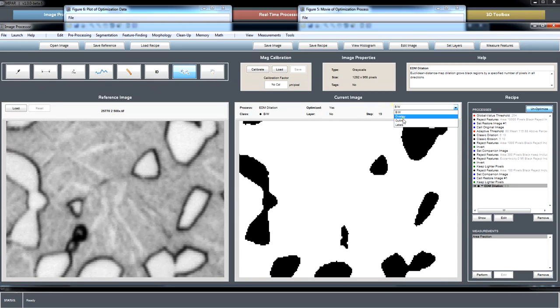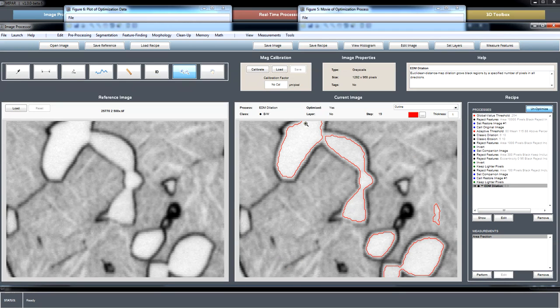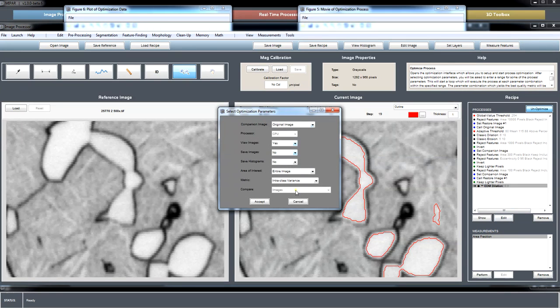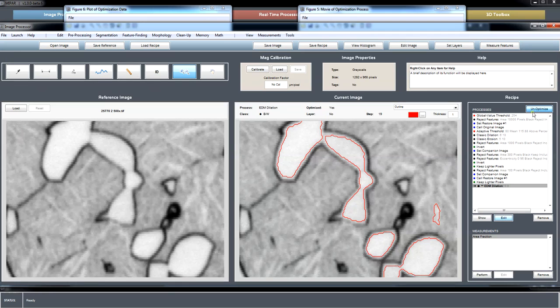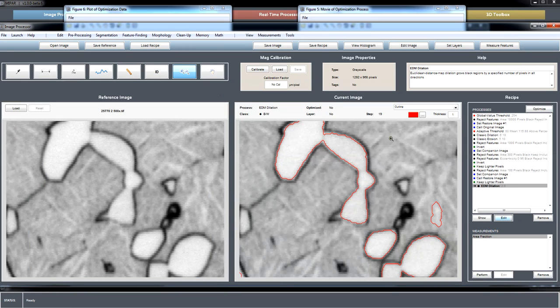So it's not necessarily what I thought would have been the optimum segmentation, but because you have this gradient here, now if you know that that's never going to fly, that although this gradient is here, because of etching the boundary really should be further out, we could say that we know the dilation at least needs to be a couple of pixels to get it closer to the edge.